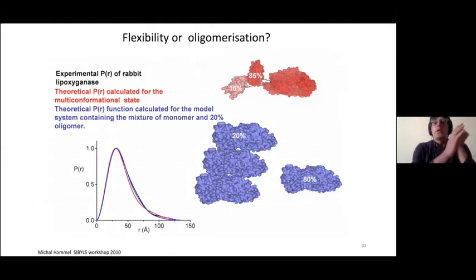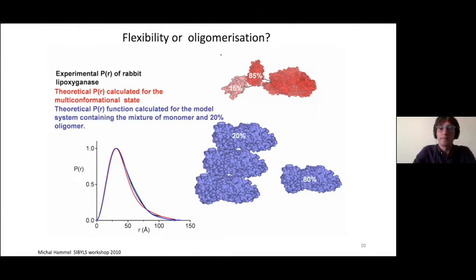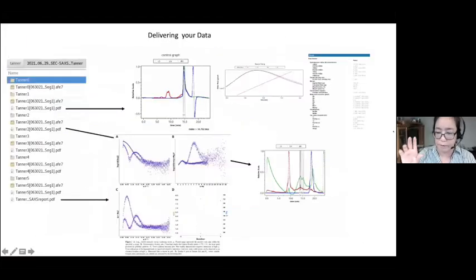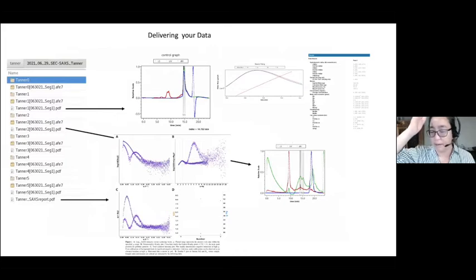Okay. Yeah, there's a question? Yeah, quick question, because I've seen this before on my samples. Could you go to the previous slide? Yeah, absolutely. You would expect that if you have aggregation, it would go to your void, which is say 8 mils or whatever. But in this case, the green is coming right at the beginning of the peak, I mean, at the beginning of the run.